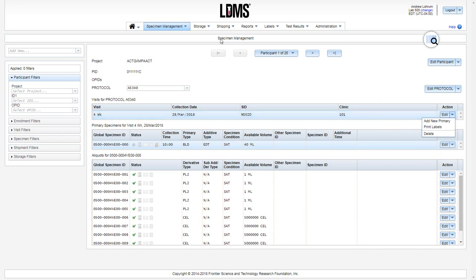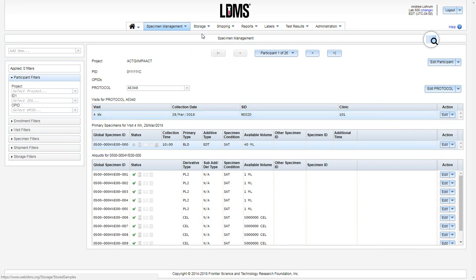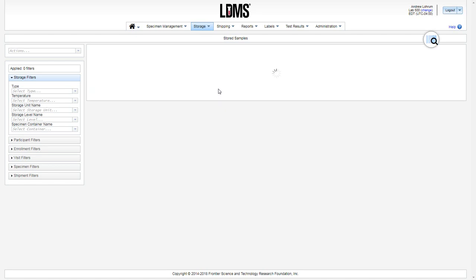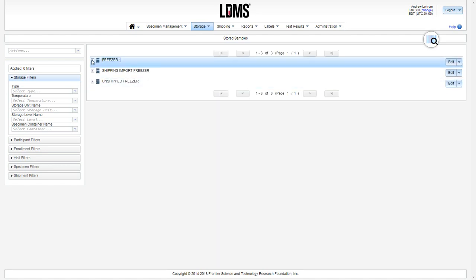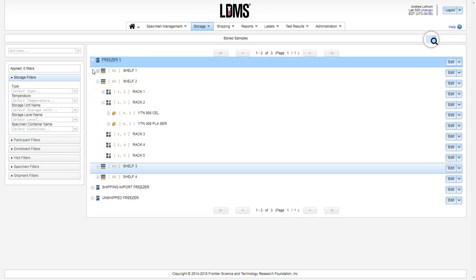In storage, clicking storage samples, the print labels option is available in each level of your storage structure.